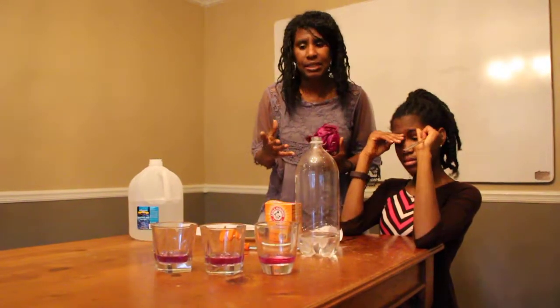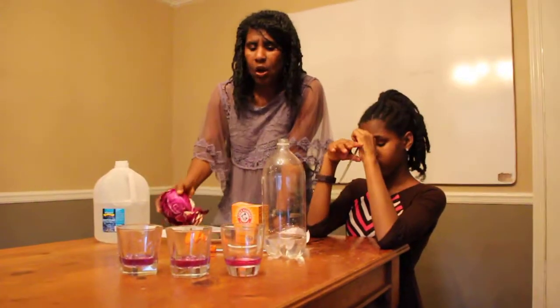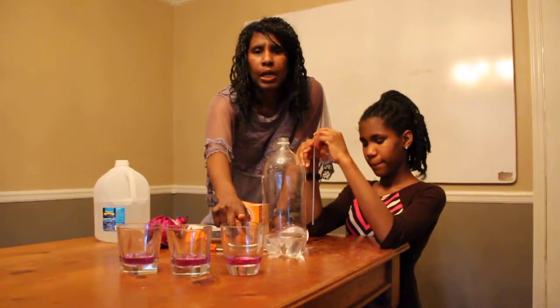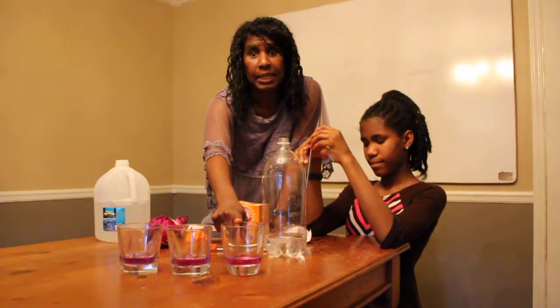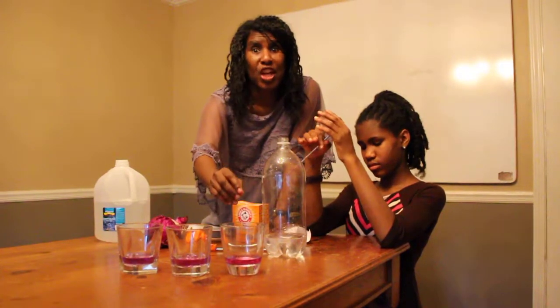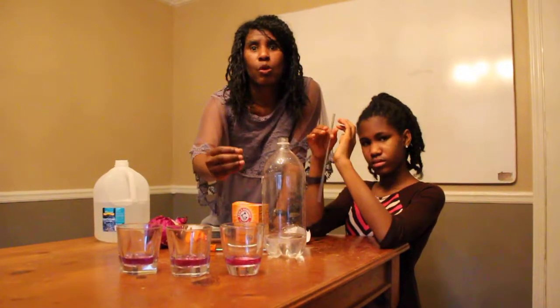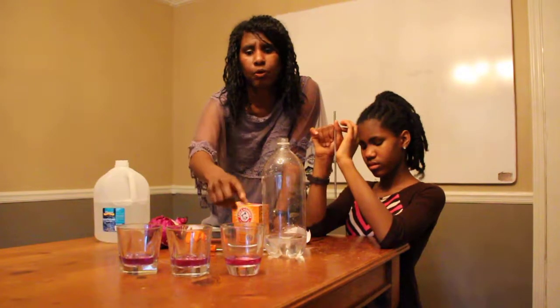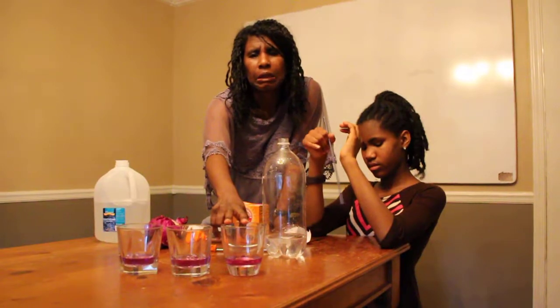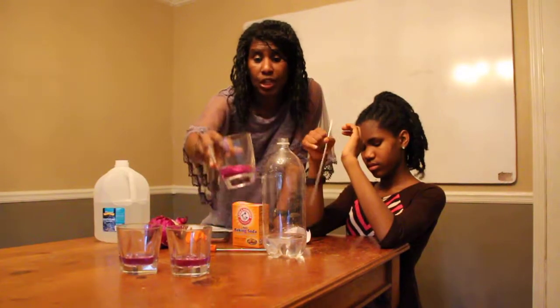And the pigment will go from blue or purplish to pink or red when it goes from an alkaline base to an acid. When we exhale, or we put in carbon dioxide, which was in the balloon, and carbon dioxide, which is in our exhaled air, when we blow it through the cabbage water, we would expect a reaction to occur in the cabbage water, which would change it to a more acidic color, as carbonic acid is formed, and we would see a color change.